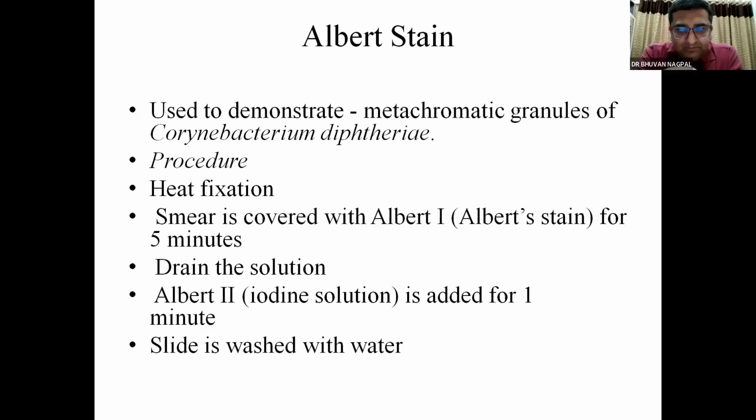So that is one practical way to distinguish, because a lot of times there will be a pseudomembrane, and with the Albert stain directly we will be seeing gram-positive bacilli. We will think it is normal flora or something else. We are not seeing the metachromatic granules, so it would be given as negative. But ideally, it should be inoculated in the Loeffler serum slope, and after 6 hours the stain should be made again, and at that time it shows very nicely.